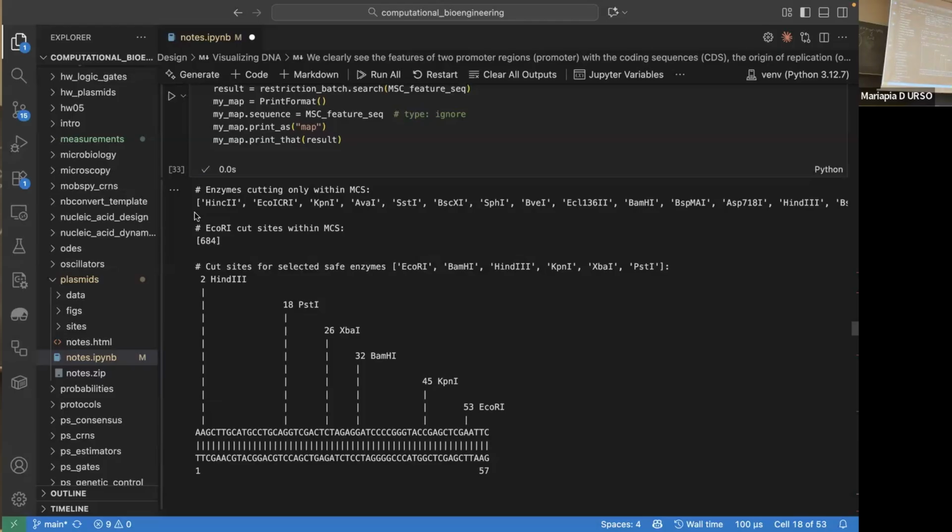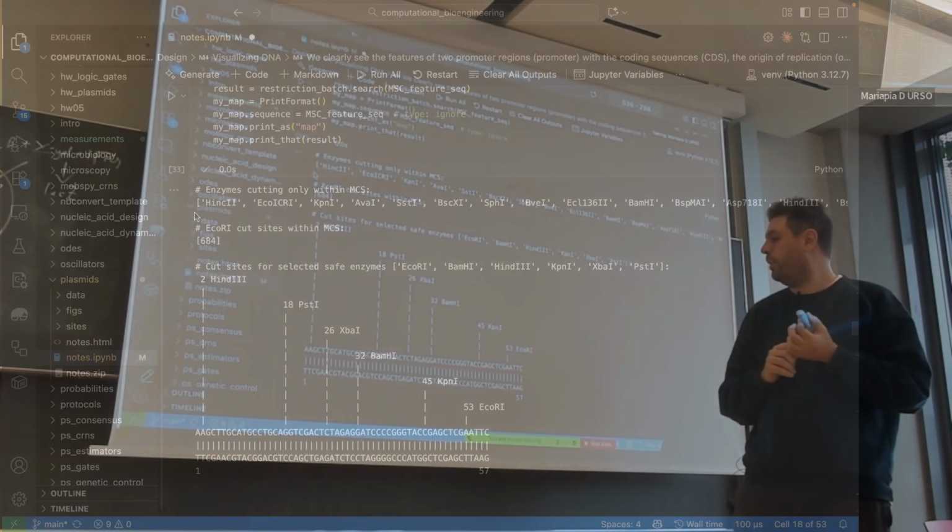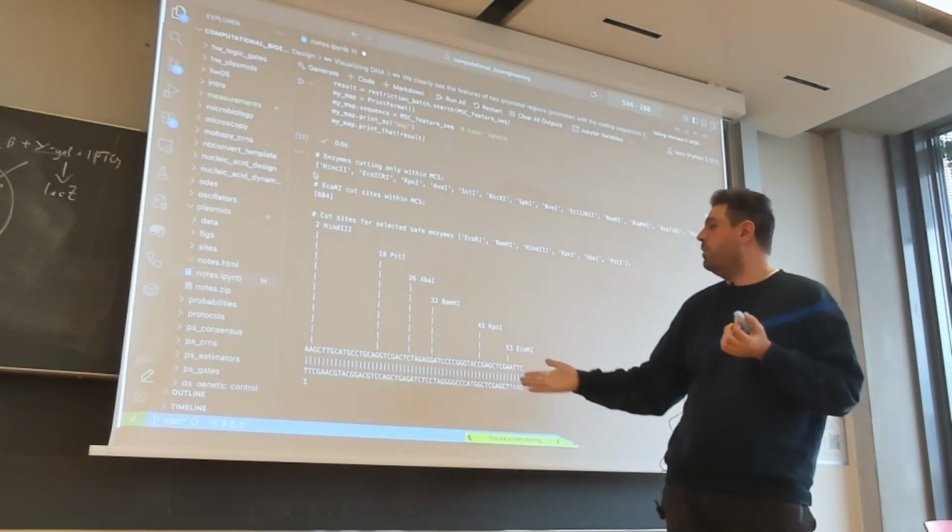We tried some enzymes that we selected that are known, quite nicely behaving ones. EcoRI is perhaps the most common one, nicely behaving, very easy, and probably present in every lab. BamHI is also a very nicely behaving one. We will pick it here for a small reason over EcoRI that I'll show you in a second, but otherwise it's completely fine.